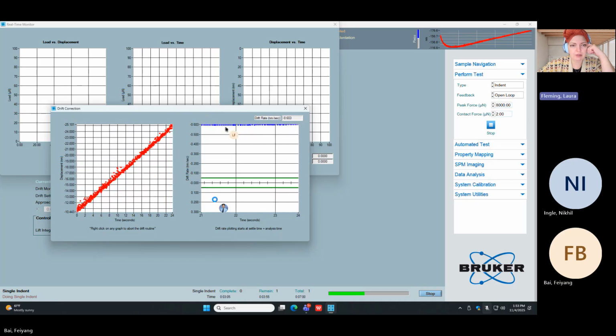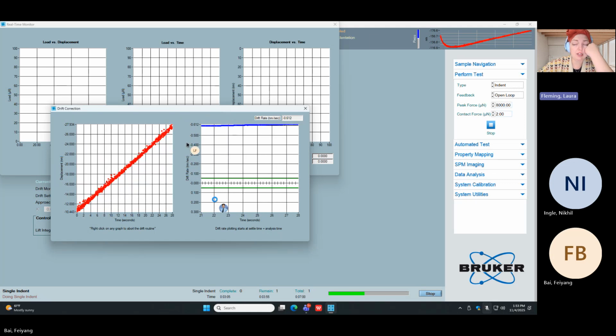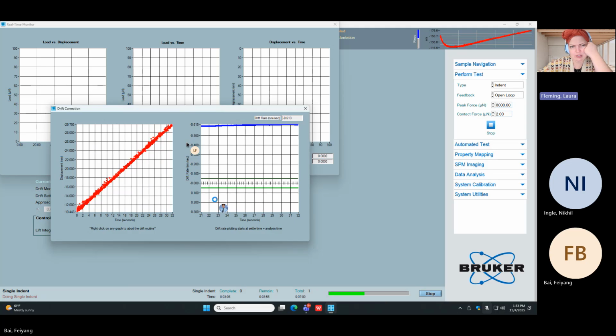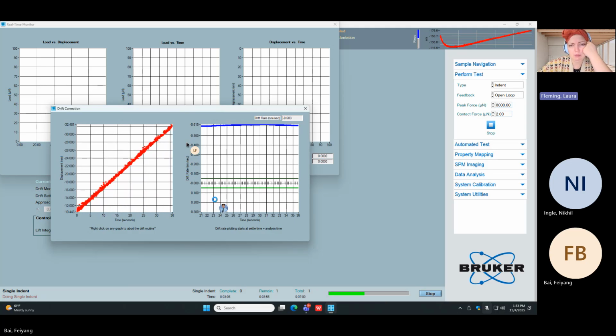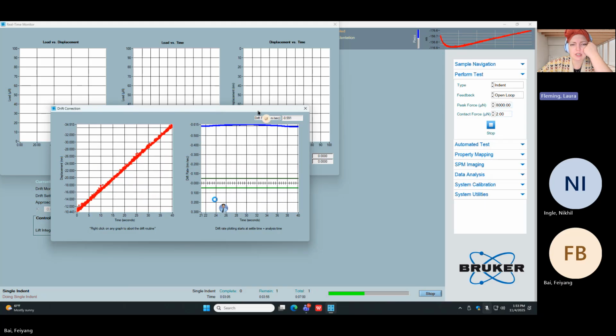Yep, so we're at about negative 0.6 nanometers a second, which is high. I'm on the higher side, I guess. I would say worst case scenario, as I typically see 1 to 2 nanometers. So higher than expected, but not at all a problem. And it's pretty constant too here. You can see that the drift rate is staying pretty constant.